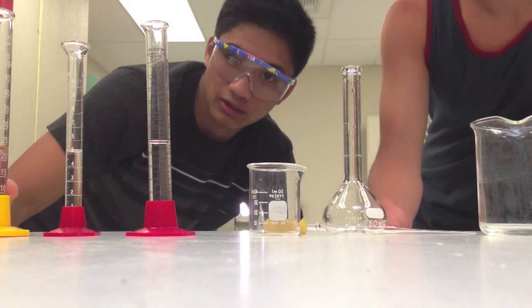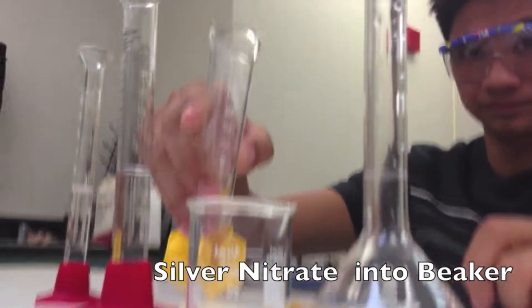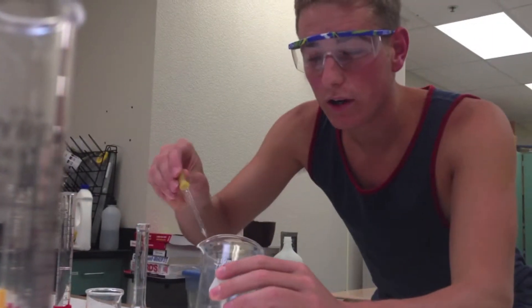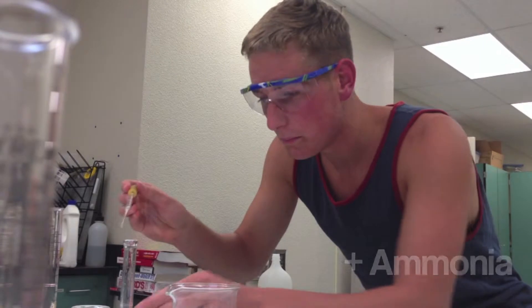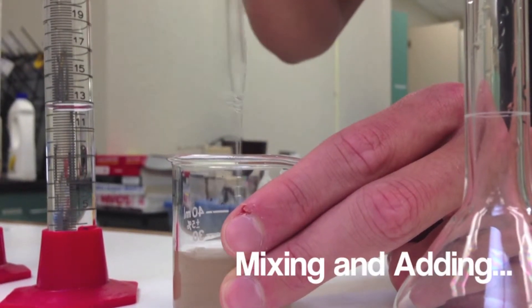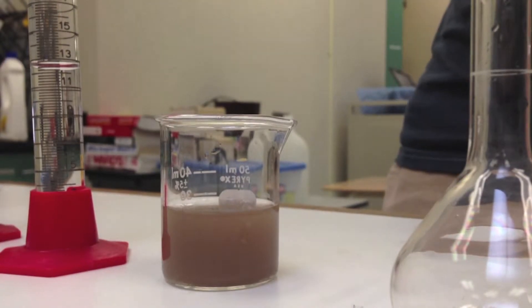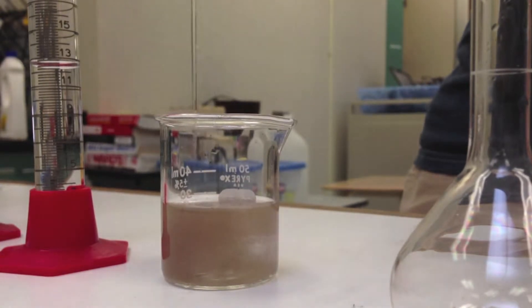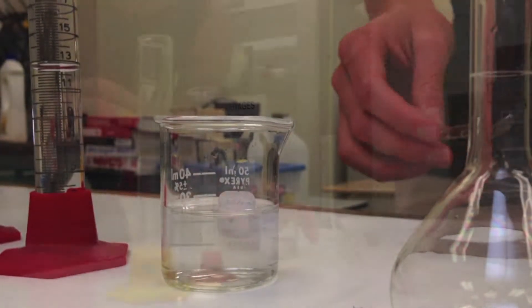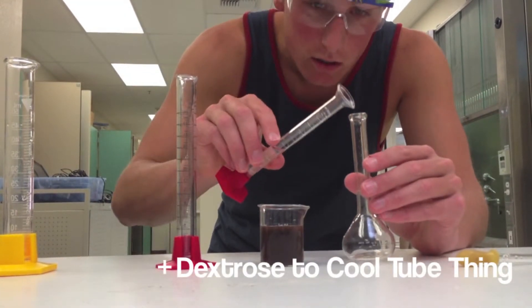First, we're going to pour this into this beaker. Jeremy, carefully add the silver nitrate. Now we are adding the base. Mix it. I'm going to add a little bit more. Adding the potassium hydroxide. Now we add the dextrose. Carefully.